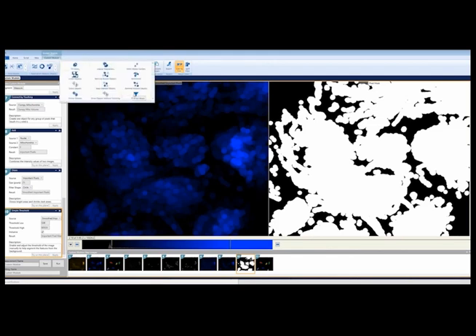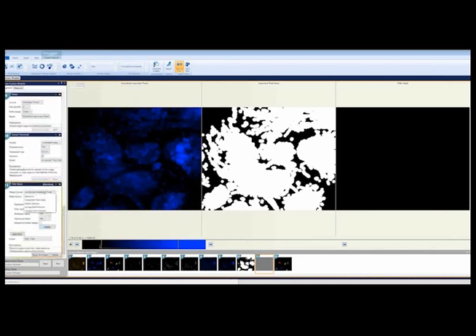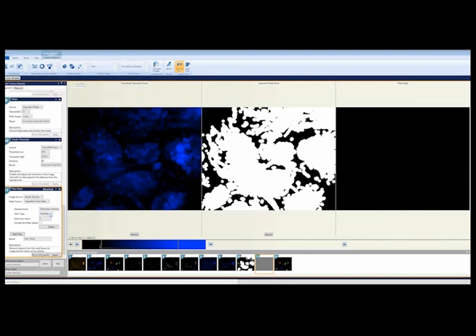After we have our mask, we will add a filter to get rid of the little things that come from noise or debris. In this example, we'll remove any objects which don't at some point touch the nucleus. The result will be our cell pixels, all the pixels that will be part of one cell or another.